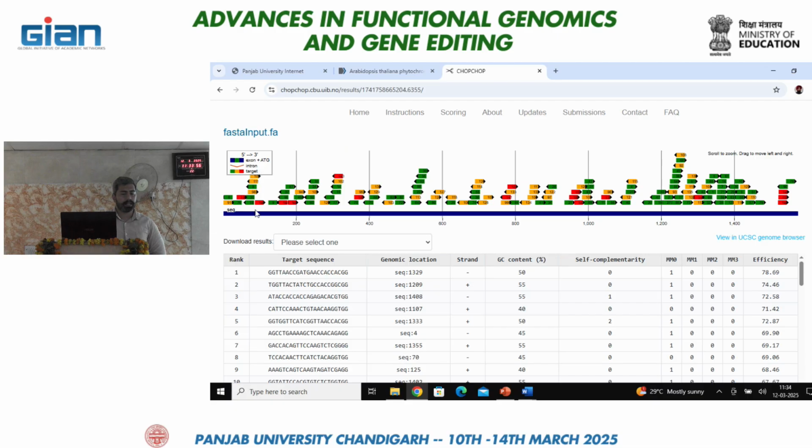Perfect, but we don't completely rely on this. We have to look ourselves as well. Like I have told earlier, the rank one is not the one which I will take if I want to continue with this. So I will take the fourth one with this PIF3 example. According to me, the fourth one is the best option.